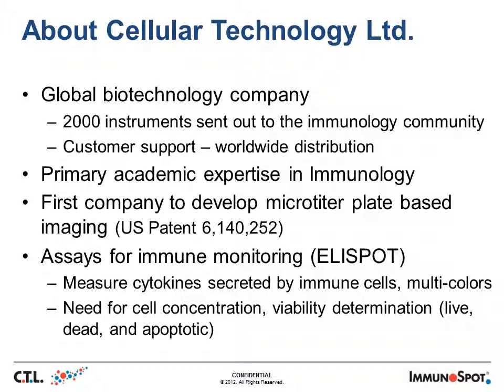For the immune monitoring assays that I mentioned, we develop and validate experiments, protocols, and methods to measure the amount of cytokines secreted by T cells. Now, these T cells are the primary defense cells in our body, whose activation is determined by the cytokine secretion, which then leads to an active immune response. Sometimes T cells can release multiple cytokines, and to detect that, we developed multicolor assays. These assays can be used either in a fluorescent-based system or in enzymatic ones.